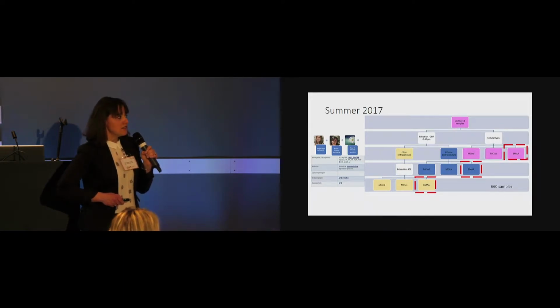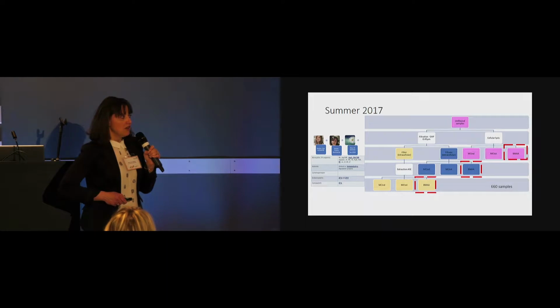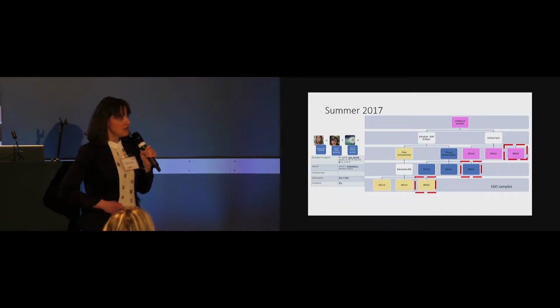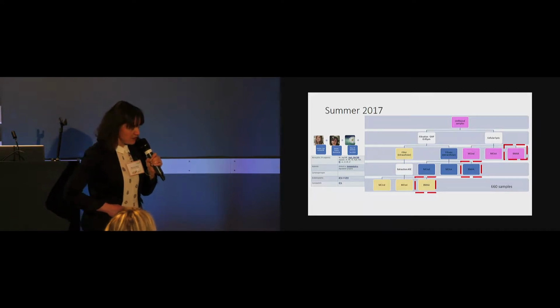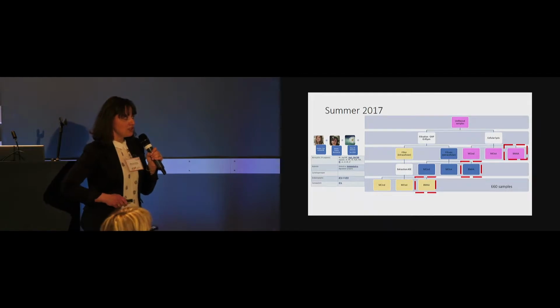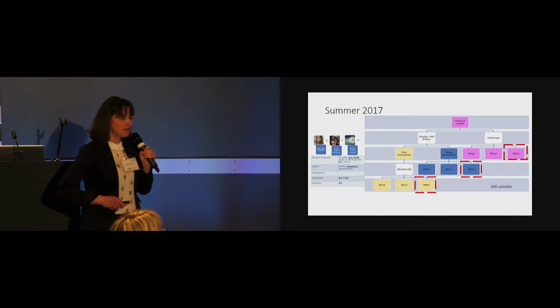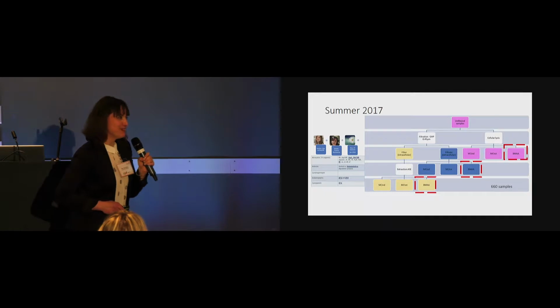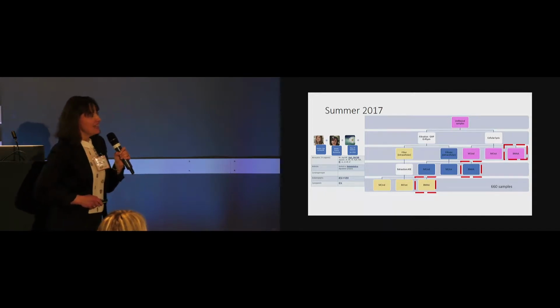In 2017, the BMAA method was not set up, so we put those samples aside in the fridge. We stored them for further analysis. In 2017, we received 660 samples. When I say 660 samples, imagine a lot of bottles ending up in our lab, in our freezer. We had to buy 2 fridges to be able to store everything and to do later analysis.